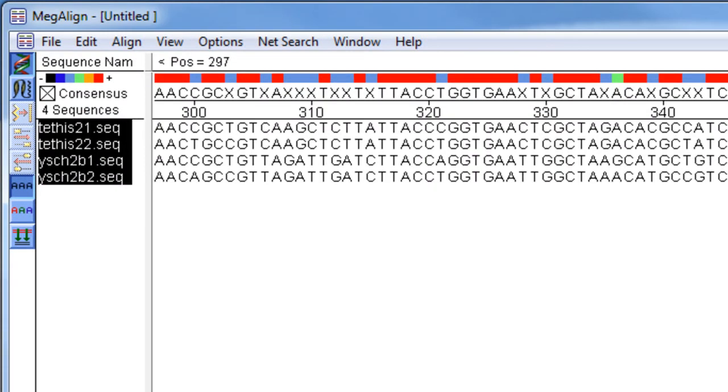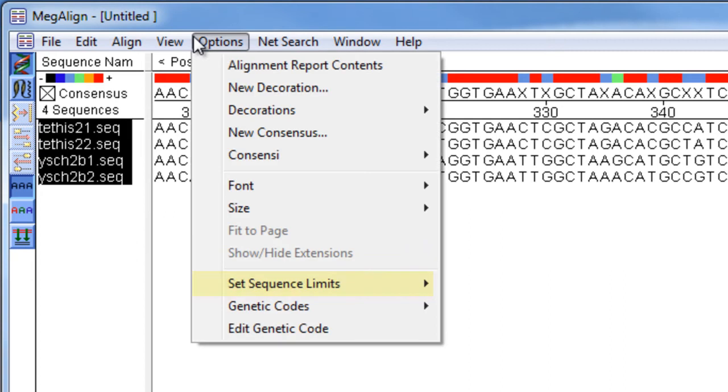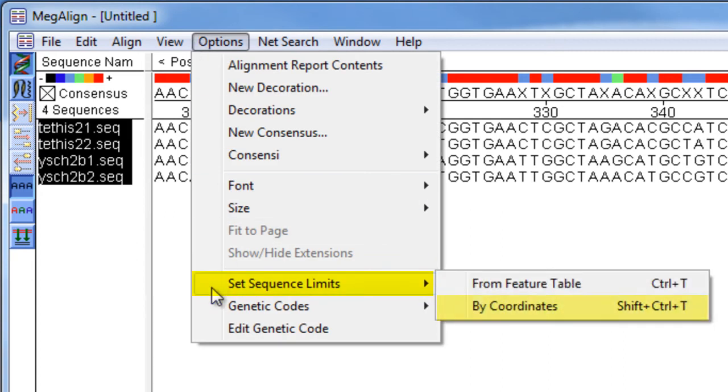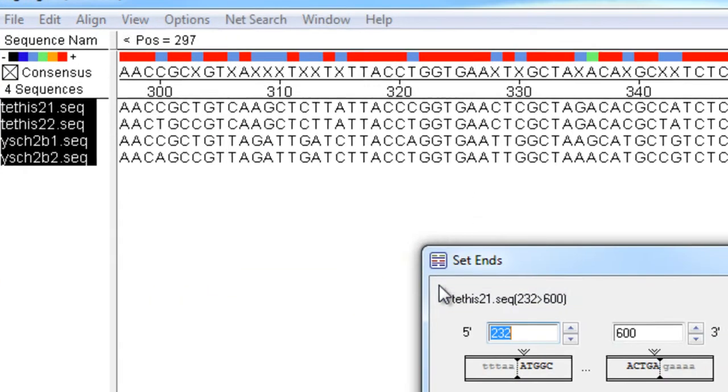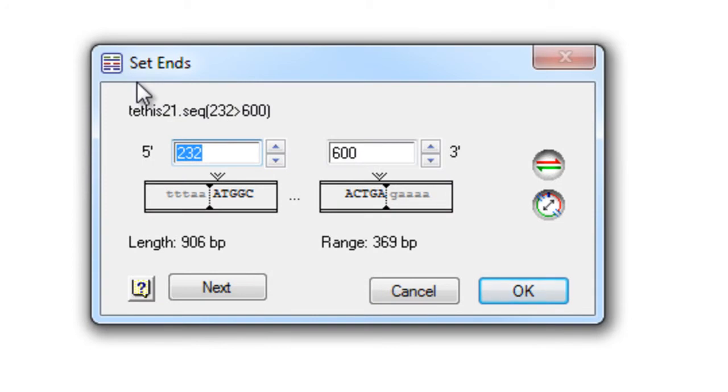If your sequences are not annotated, you can specify the range of each sequence to use by going to Options, Set Sequence Limits by Coordinates, and this opens a Set Ends dialog.